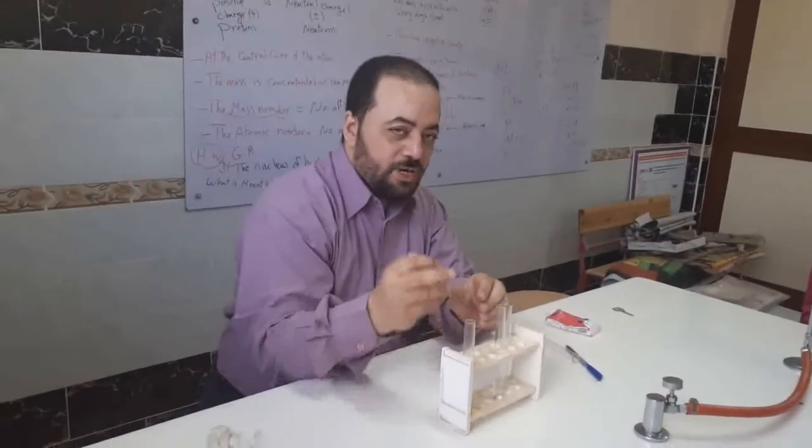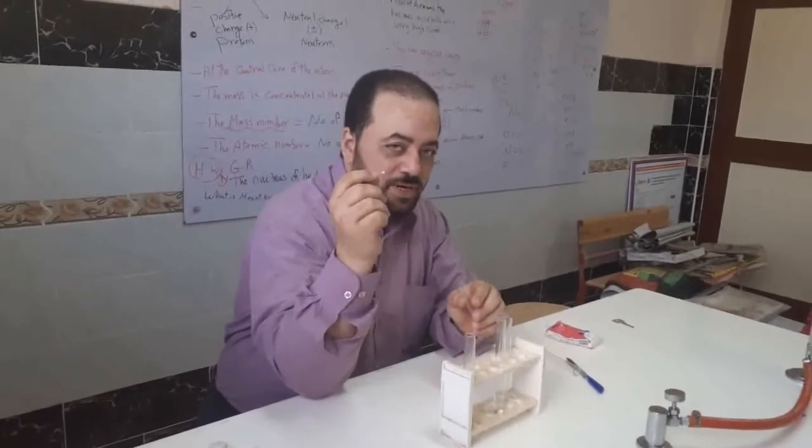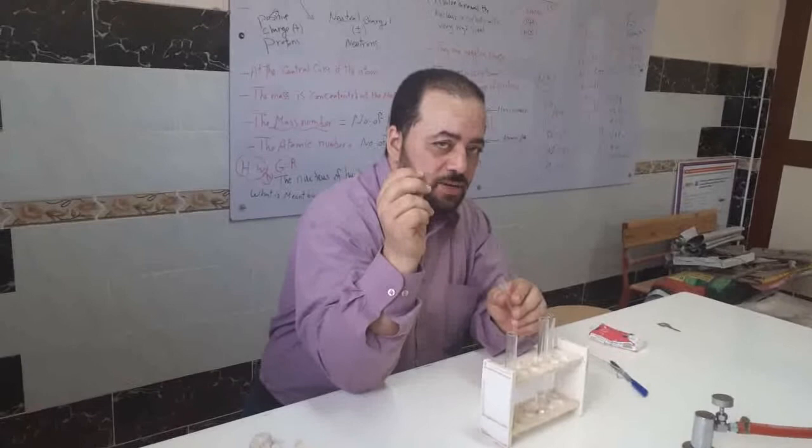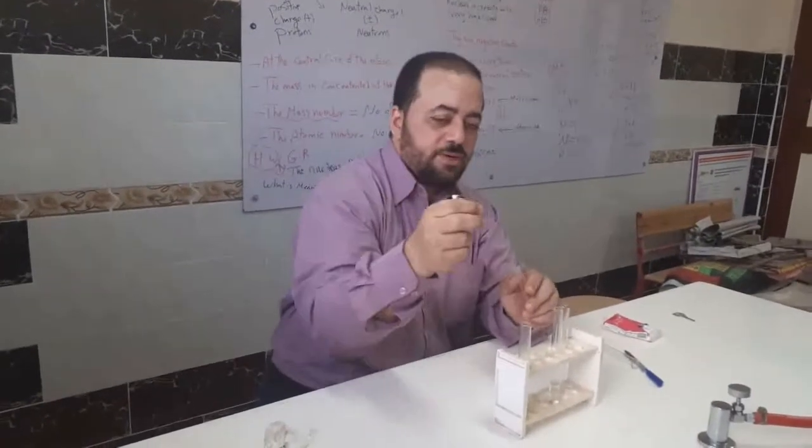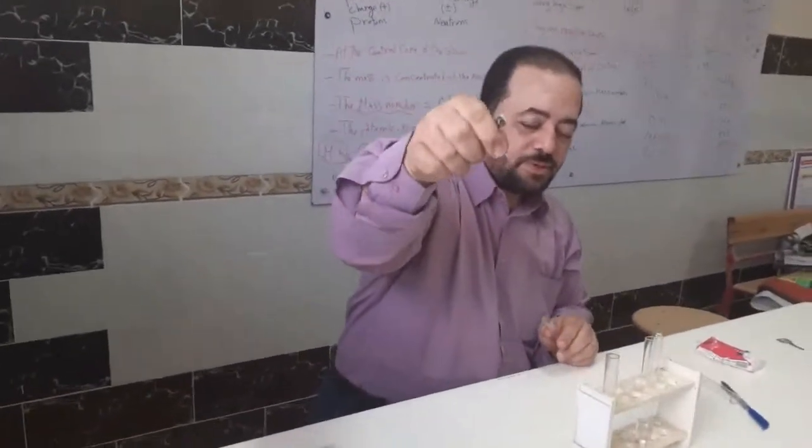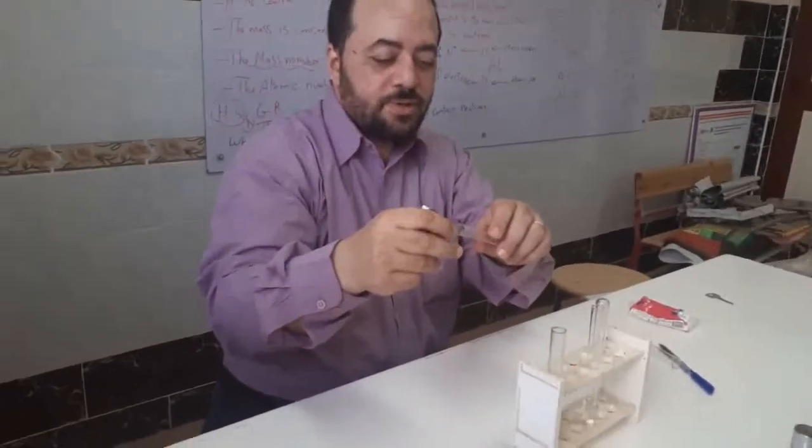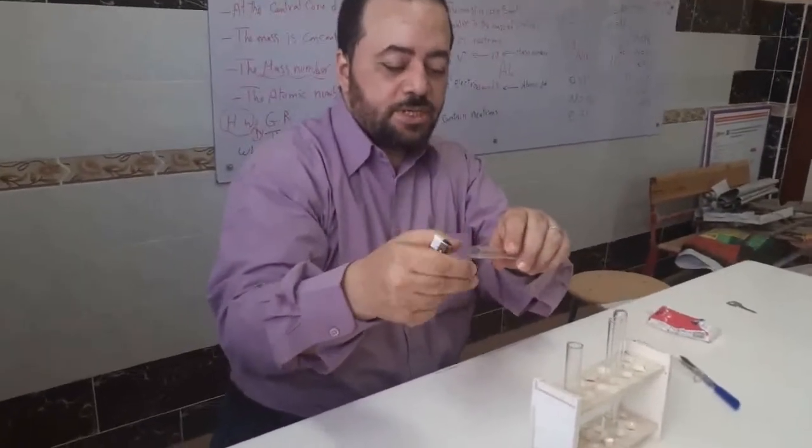Now we do another experiment. The reaction between magnesium and oxygen forms magnesium oxide which is a white powder. This is the magnesium strip. We will burn the magnesium strip.